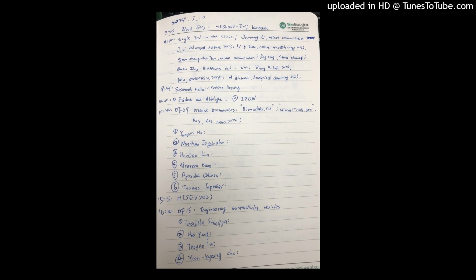Because, for example, if you would do size exclusion chromatography or density gradient or whatever, I have no clue, at least then you know that it's unlikely that you separated the platelets from the vesicles, and you should be careful with the interpretation of your data. And you should not say that it's a microRNA associated with the vesicles, but perhaps in an EV-enriched fraction. So we're using proteomics as a readout, so we get a lot of data. So for instance, we can measure lipoproteins directly. We also get platelet markers.